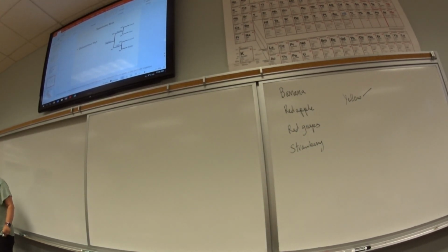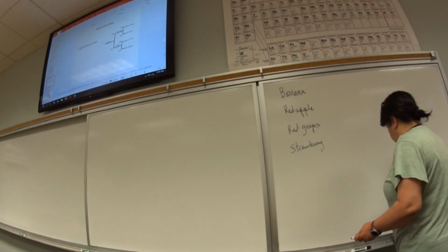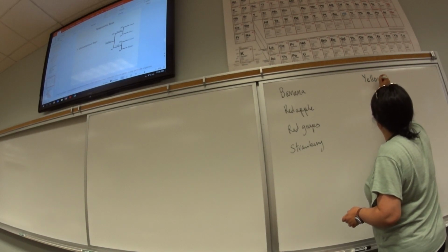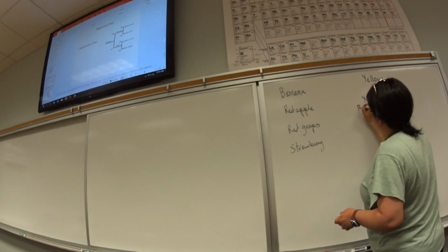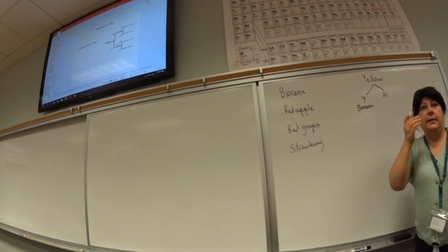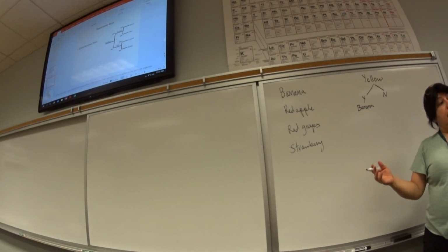So how I want you guys to write it is this. We start with question 1, yellow? Yes, no. It's yes, therefore it's a banana. I'm not going to differentiate it any further. Nothing else is yellow there. No?